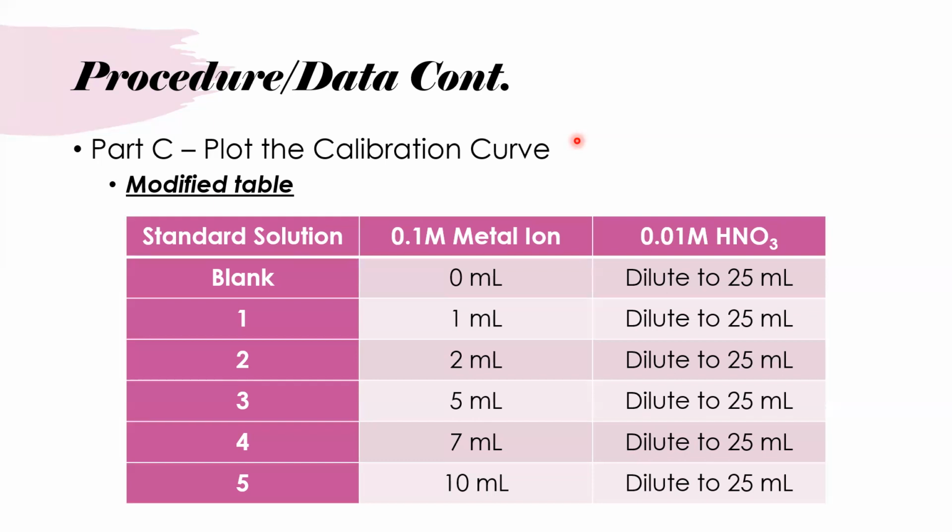And then the absorbances that Lee emailed to you, right? You use those two sets of values, the absorbances, as well as the molar concentration for the diluted samples that you yourself have to calculate, which you did an example of in number 2.C in your pre-lab assignment.